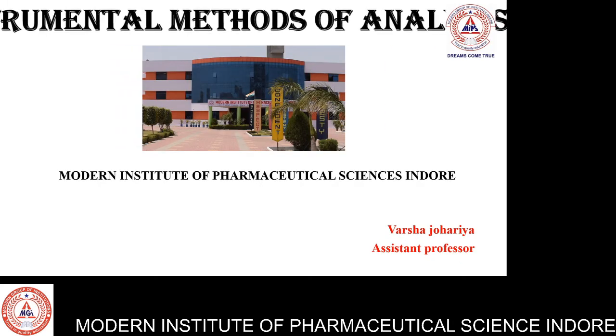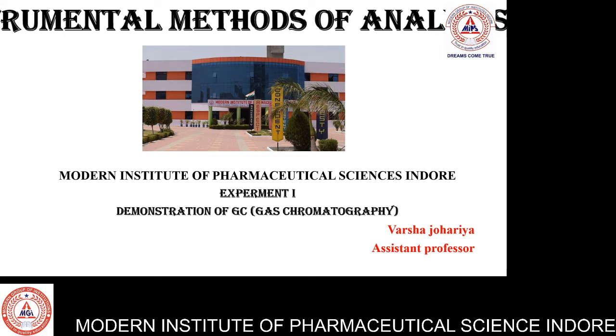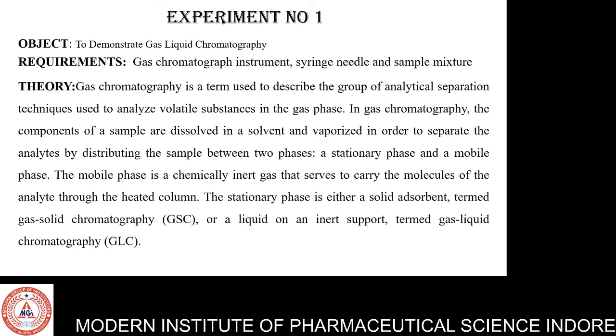Today, we are starting our practical series of instrumental method of analysis, and experiment number first is the demonstration of gas chromatography techniques, GC. The object is to demonstrate gas liquid chromatography or gas chromatography. Our requirement is a gas chromatograph instrument, syringe needle, and sample mixture.